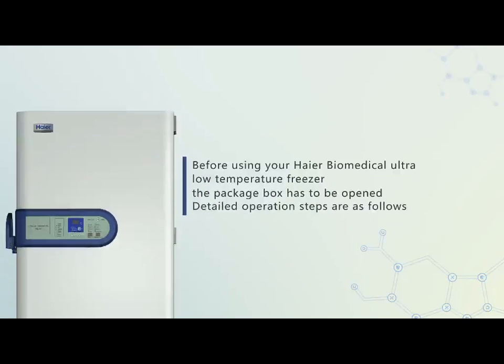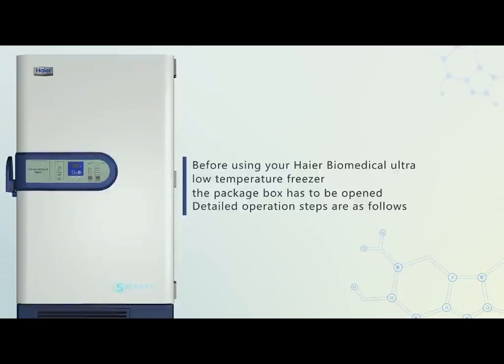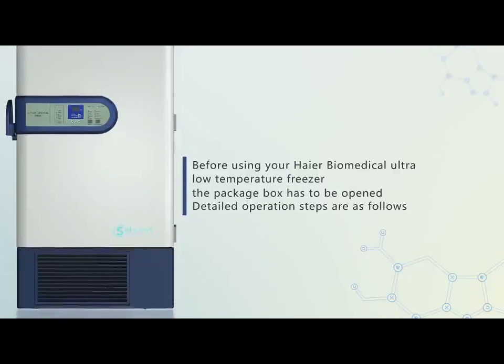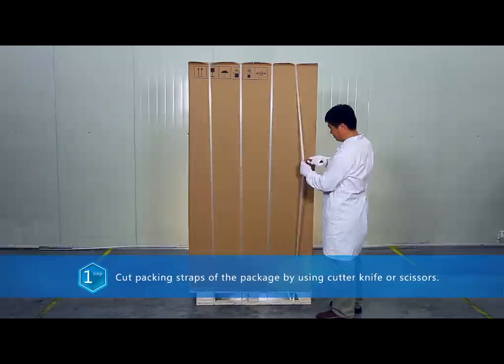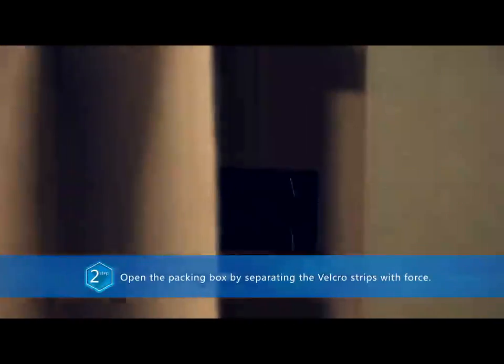Before using your Biomedical Ultra Low Temperature Freezer, the package box has to be opened. Detailed operation steps are as follows: one, cut packing straps of the package by using a cutter knife or scissors to open the packing box.